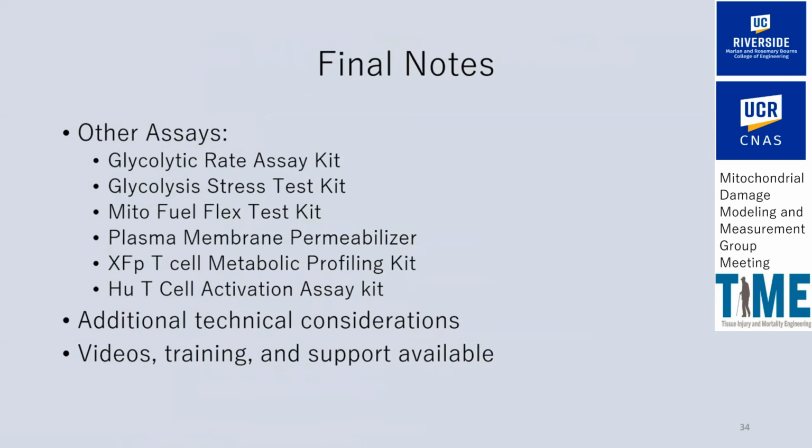There are other assays that you can perform on the Seahorse: the glycolytic rate assay kit, the glycolysis stress test, and a few others here. Generally, the ones I just mentioned are the most common you'll see published, and they're the most common here on campus. There are additional technical details that I'll be talking about later. I'll be recording that as well. But if you want to learn more today, there are videos, training, and support available from Agilent, the company that makes the Seahorse. And with that being said, I want to open it up to questions at this point.